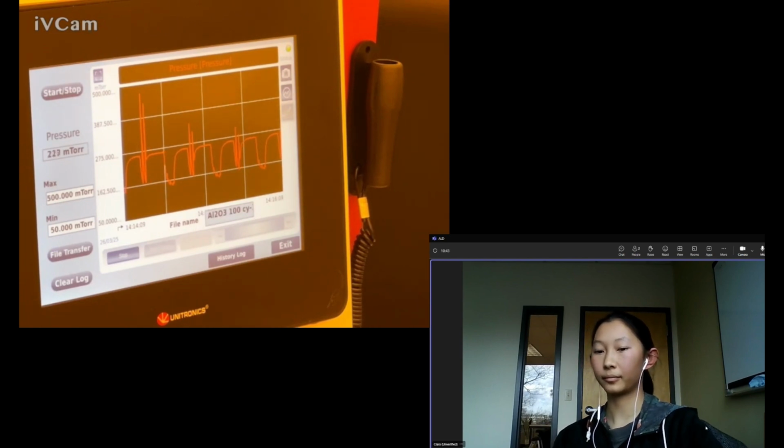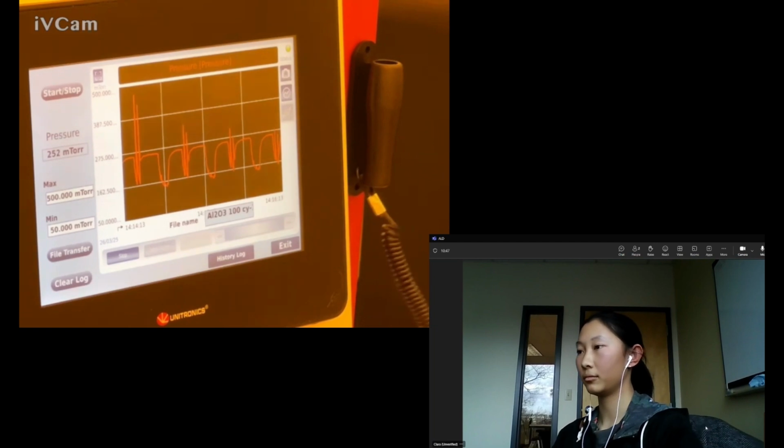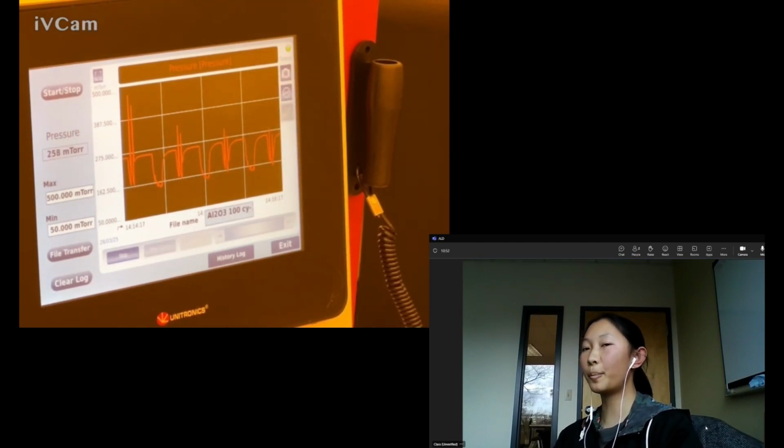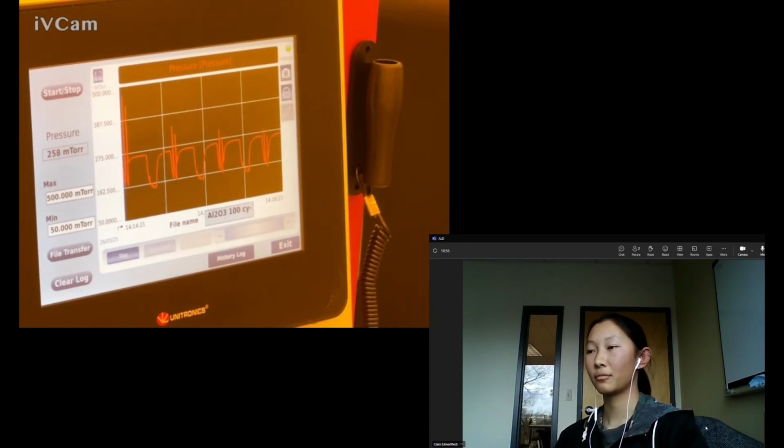Oh, water doesn't have a valve on it? No. That's what I was wondering, because I did not turn on any valve on the water. Just wanted to make sure. So if you pulse that line for the water, it will always just dose into the chamber.